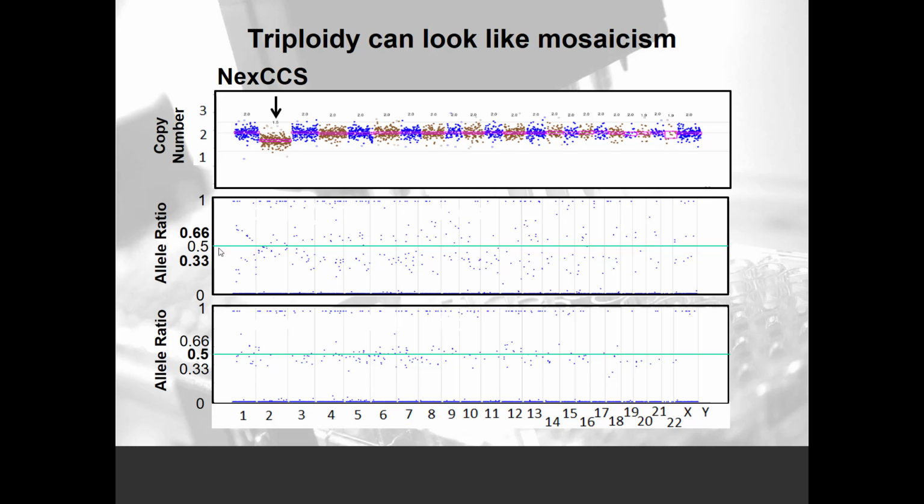And this type of analysis allows you to identify this particular embryo as triploid, so that in fact all of the copy numbers for these chromosomes are 3, and for chromosome 2 there are actually 2 copies. Again, this is an example where simply looking at log2 ratios would have suggested a mosaic prediction, but in fact, based on genotyping allele ratios, this particular embryo is triploid.